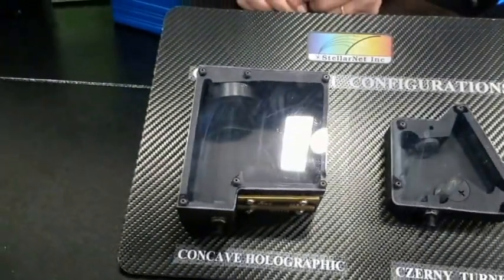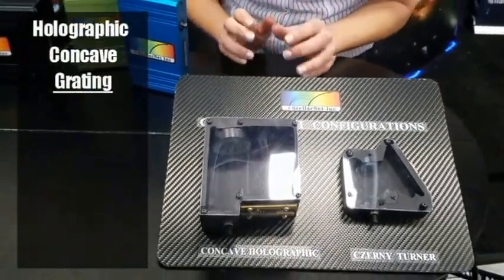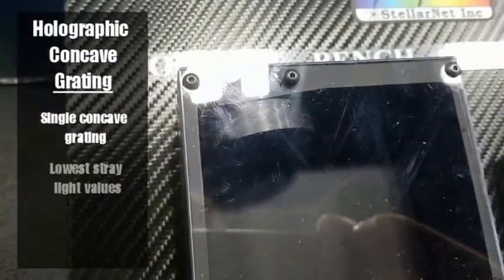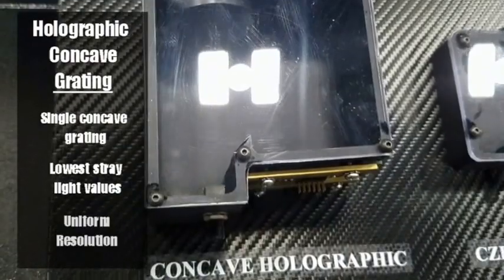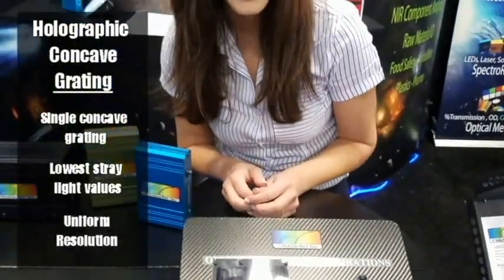And right next to it is our holographic concave grating spectrometer. This is our research grade design. As you can see, there are no focusing mirrors in the optical bench. So what that means is there's less light loss. Also, it has a holographic grating, so you get flat field imaging onto the linear detector array. You can do a uniform resolution.